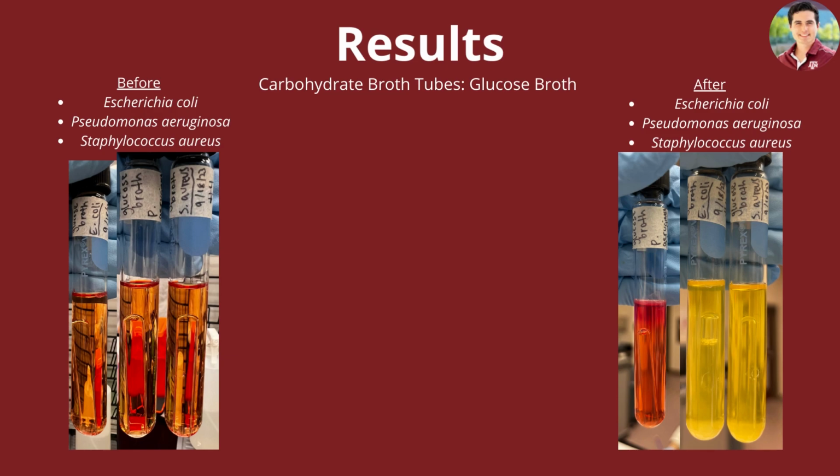It is a little less than E. coli, but it is still a result of a positive carbohydrate reaction. S. aureus is generally capable of fermenting glucose to produce acid.